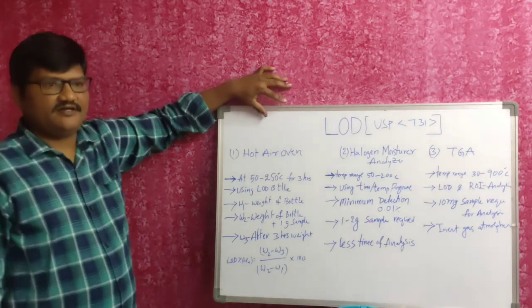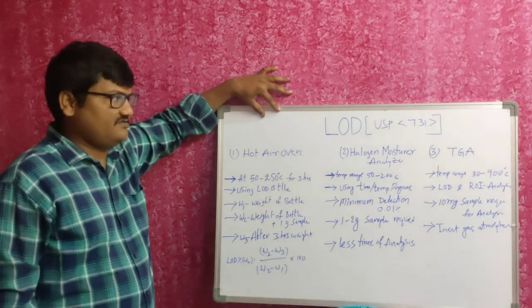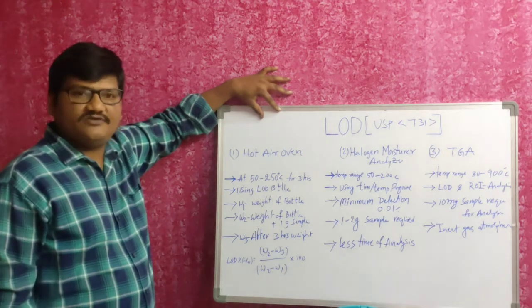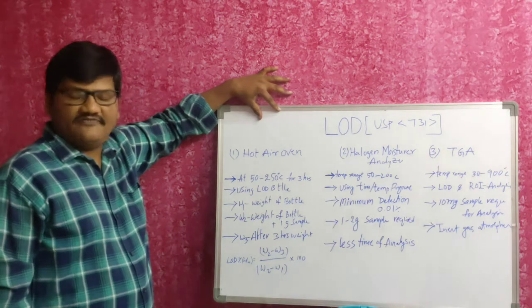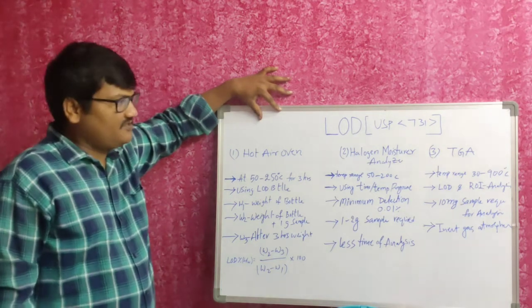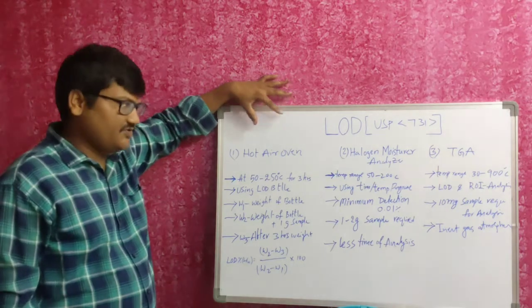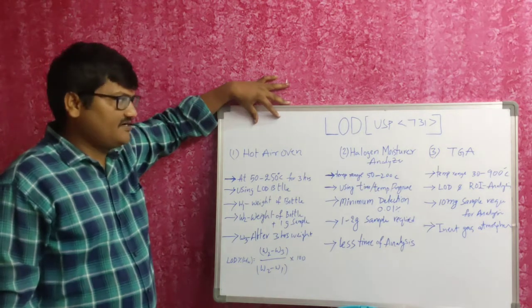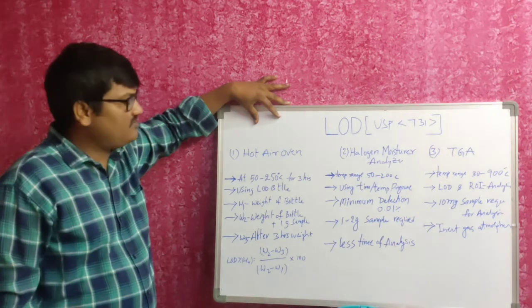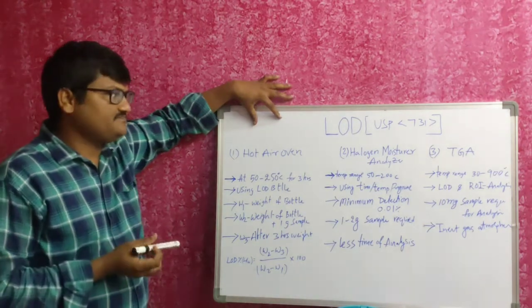Any drug substance contains some volatile matter, whether water or solvent. These are the solvents or water used in the manufacturing unit for the purification technique of the product. Even after drying at a certain temperature, trace levels of them remain bound with the drug product, and that can be estimated by loss on drying.